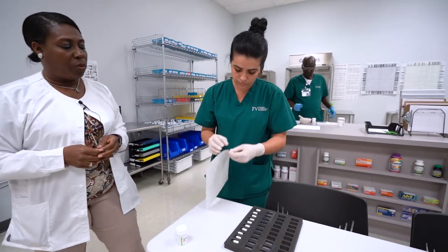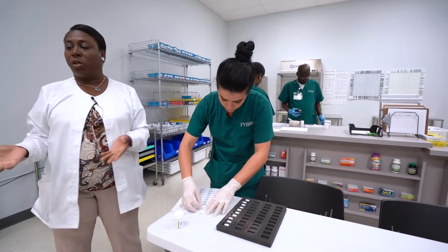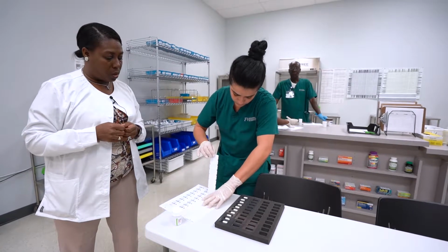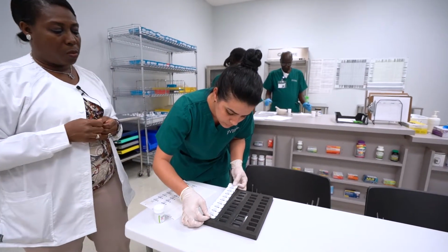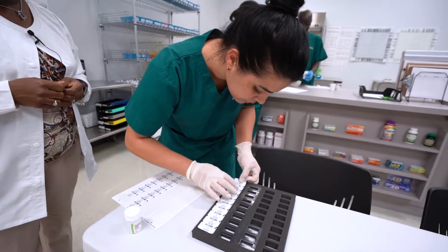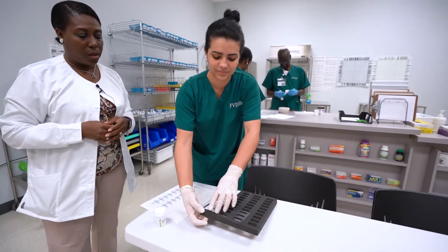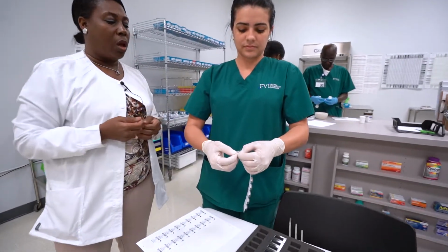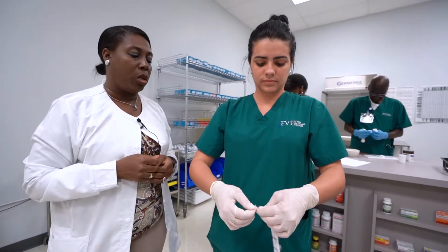Next, she's going to peel off a set of labels. And again, we have different systems that we can use to repackage or unit dose medications. And again, voila, finished product. She lifts it up, everything is unit dose. Now the patient can use those, or we can have those supplied to the nursing unit for the medication in its own individual packaging.